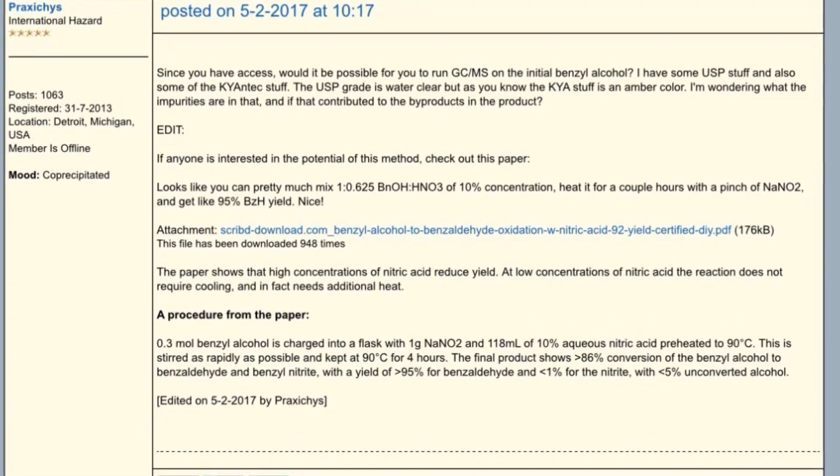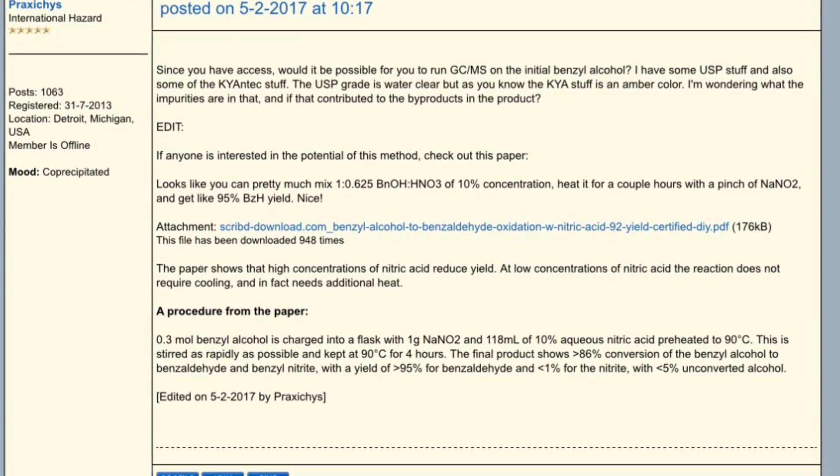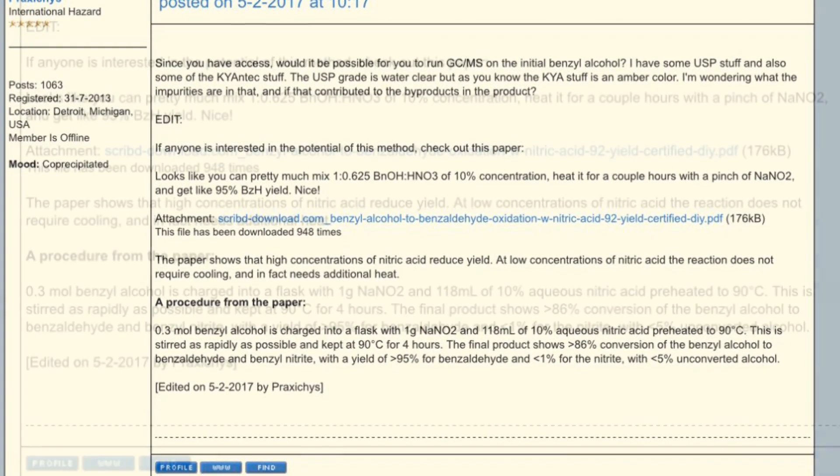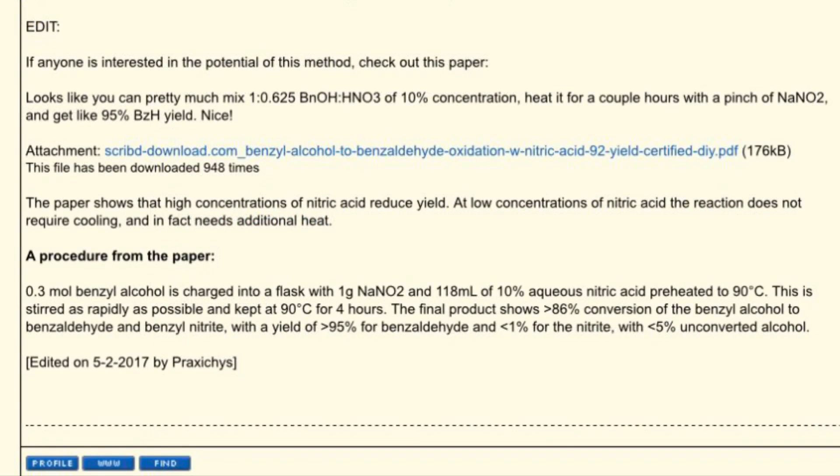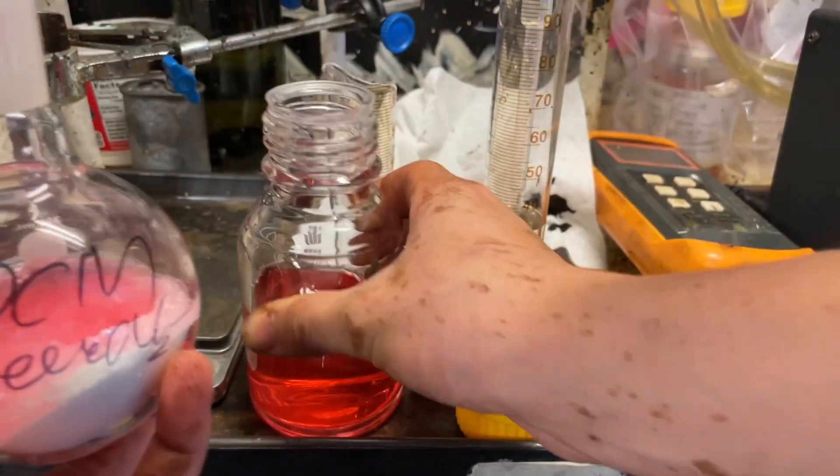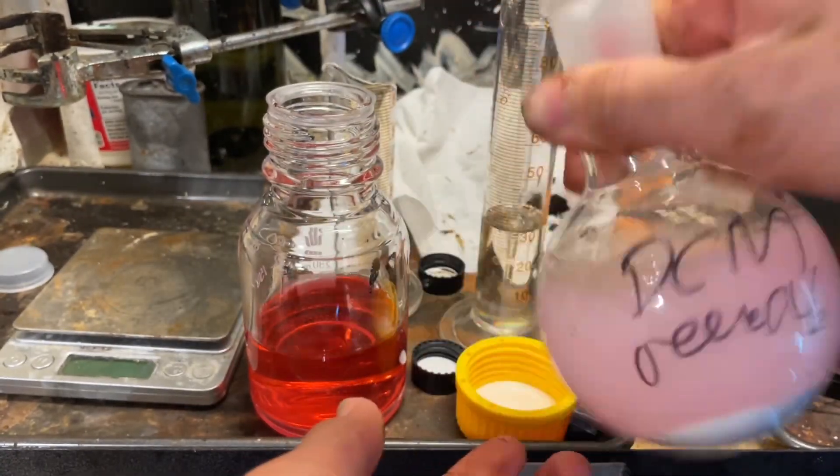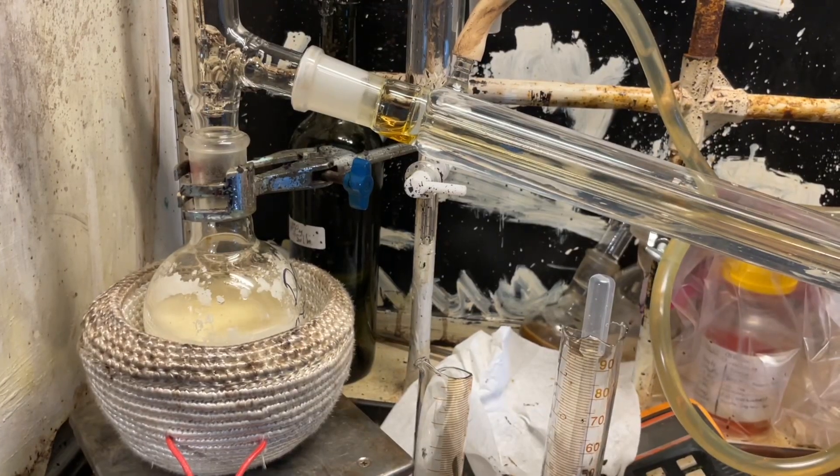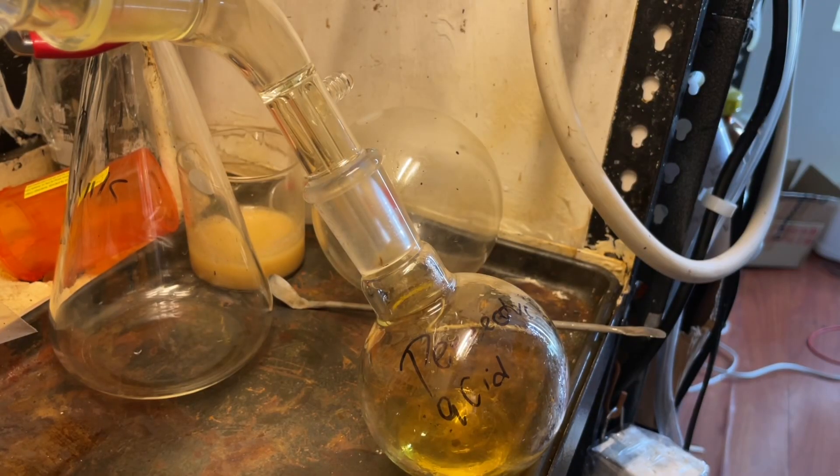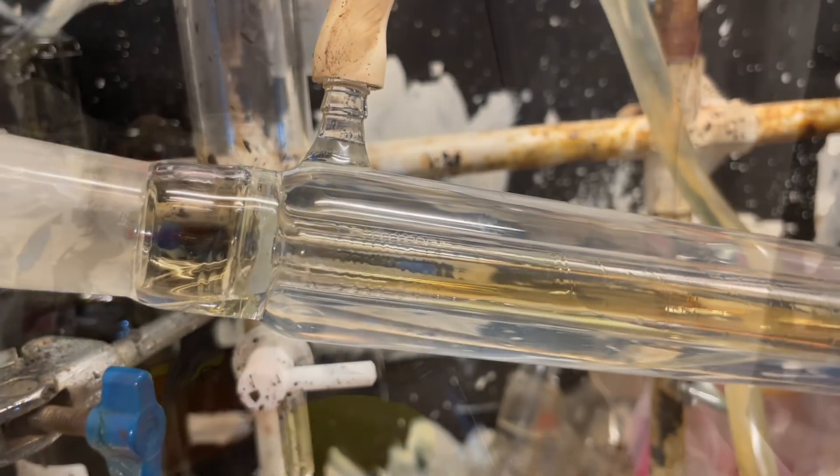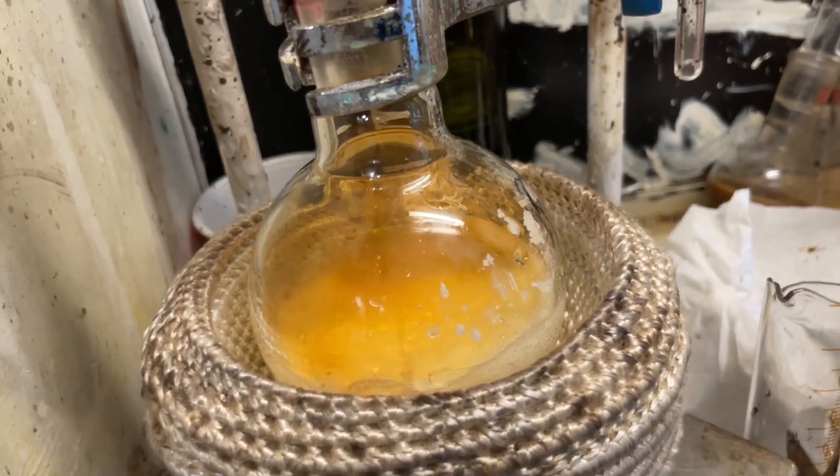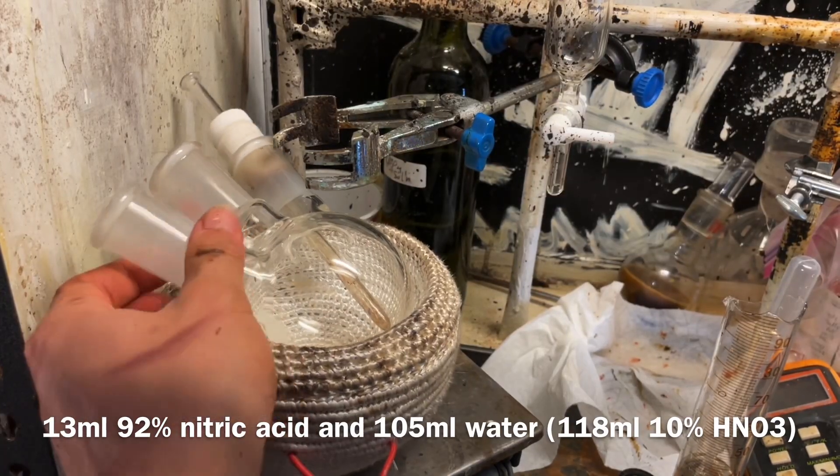Like I said, we'll be using the nitric acid method, which I found on a Science Madness post here. I believe Tom's lab has also made a video on this before, but I'm gonna be using a bit different method, because I won't be using 68% nitric acid. I'll be using 92%, because that's what I prepare. So, like I said, it's nitric acid montage time, because I actually don't have a lot of nitric acid in stock now. I can make it. I have a lot of nitrate. I just don't have as much sulfuric acid, and I'm too lazy to prepare it right now. But enjoy this. And surprisingly, the acid concentration I got measured by density was 92%, so that's not too bad.